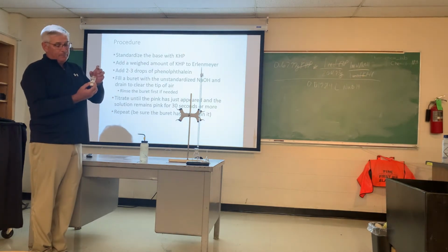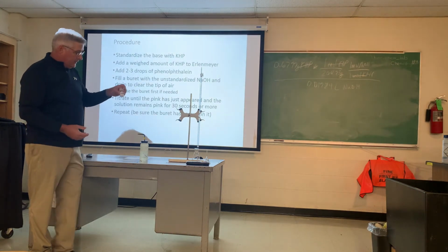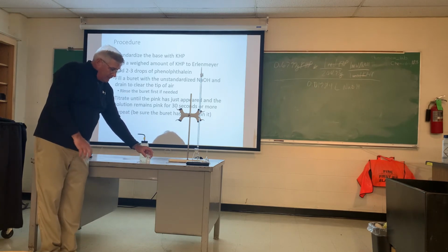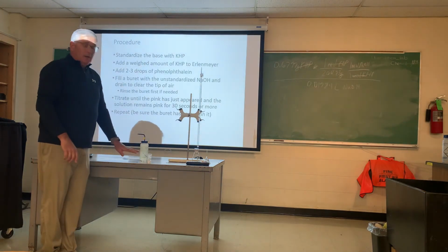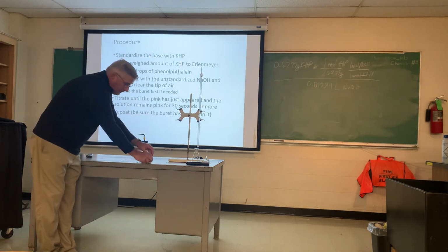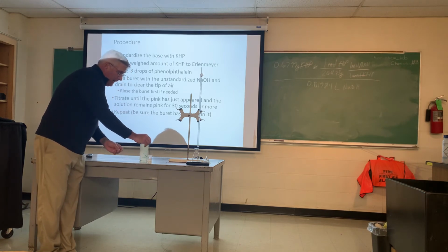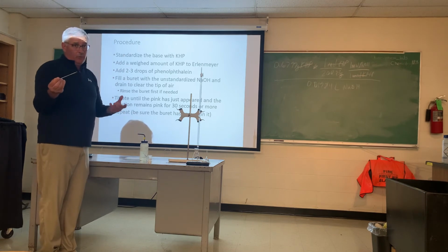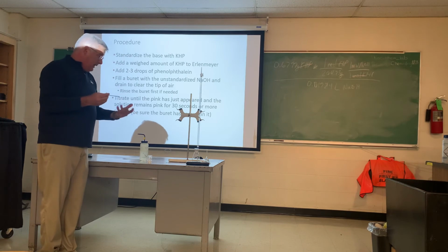And so the KHP then, what you're going to do is take the vial itself and put it on the balance and tare it, and then you're going to take the lid off, and leaving it on the balance, you're going to remove about 3 to 4 scoops from a small scoop, to get the mass that you need.